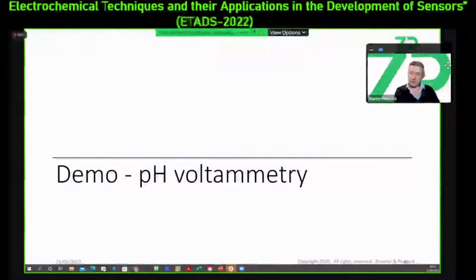And then from there, we've now transitioned into these demonstrations of technology. And so we did 2 CV experiments, 2 cyclic voltammetry experiments, a simple one with ferricyanide, you saw was quite simple. Then capsaicin, which is kind of interesting because the first scan was different from the second scan. And we explained that during the first scan, we had a chemical reaction going on.